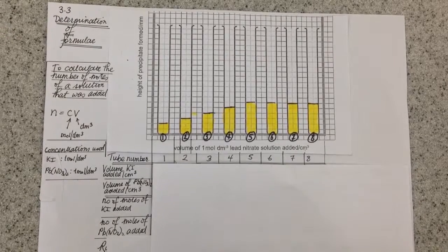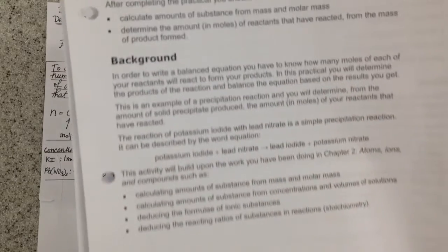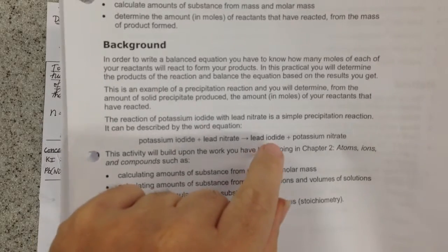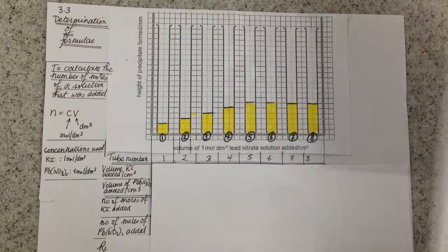So this is a talk through of the sheet determination of formula, finding the formula of a product. In this sheet what you do is you take potassium iodide and lead nitrate, you react them together to get yellow lead iodide and soluble and colourless potassium nitrate.